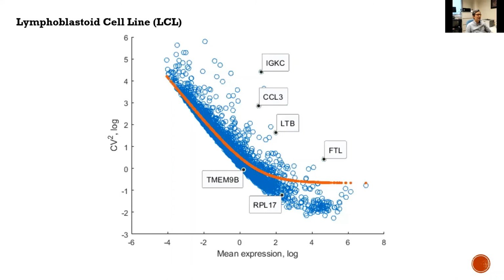So we can use the method we presented before for selection of highly variable genes, and you plot out the relationship between the mean and the CV. Here we use CV squared, in a log plot, and it's a relatively linear negative correlation between these two parameters.